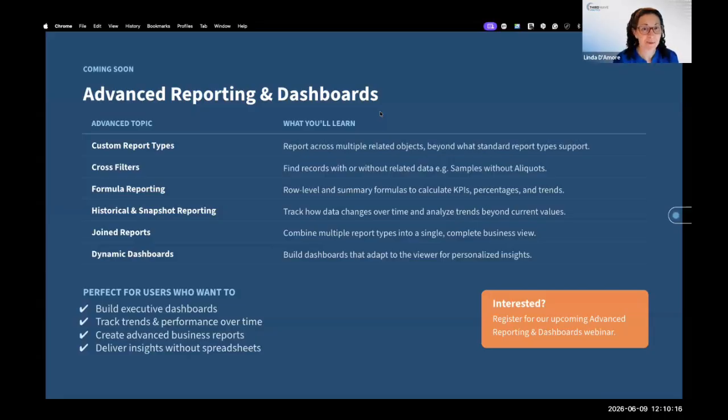There are some things we're going to hint at today, but a lot more is available. We would love to hear from you and see if you are interested in a more advanced seminar. At the end of this webinar, we're going to run a survey, and you can leave your email and we can contact you and let you know about the date of the upcoming seminars.